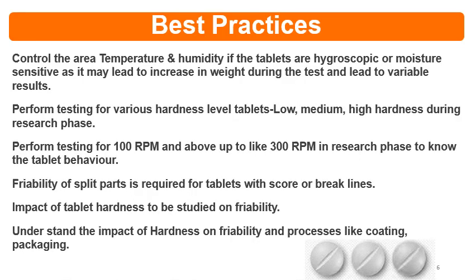Now coming to the best practices for friability testing and troubleshooting. Control the area temperature and humidity if the tablets are hygroscopic or moisture sensitive, as it may lead to an increase in weight during the test and lead to variable results. See, this is very simple: if you put 6.5 gram inside the drum and perform the test, and you get 6.6 gram or 6.55 gram of tablet weight after friability testing, then how will you report?